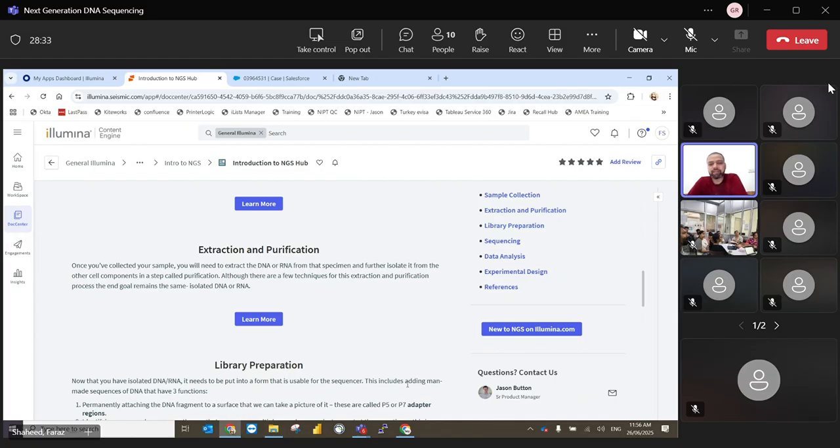So quantification of DNA is very important because we have one slide in our company that says garbage in, garbage out. So whatever you put in the sequencer, you get similar data. So if your DNA was pure and of high quality, you'll get high quality data. So how do you assess whether the quality of the DNA is good or bad? There are two ways mostly.